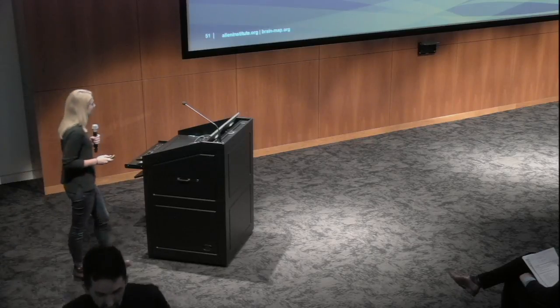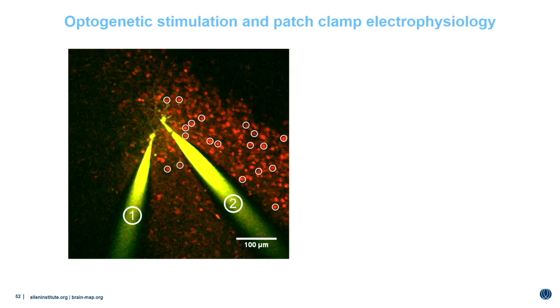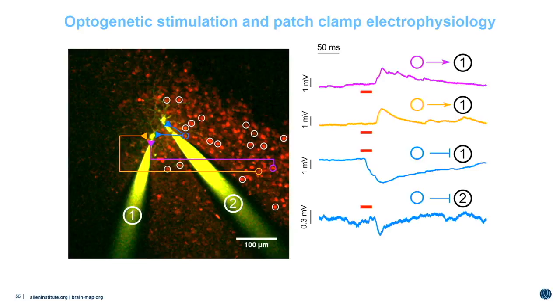All right, thank you, Luke. So I'd like to start with just an example of what these optogenetic experiments look like. So here we're looking at a slice of cortical tissue. These red cells express light-sensitive proteins called opsins, and I have 2 electrodes here recording from these green cells. In this very specific example, we can shine our laser on this purple cell right here. It causes it to spike, and because it's connected to this cell, we see a small synaptic response. Similarly, we can shine our laser on this cell, and again, we'll see another small synaptic response. Note that both of these connections are excitatory. Whereas this cell right here actually provides inhibition to both of the cells I'm recording from, although with different strengths.